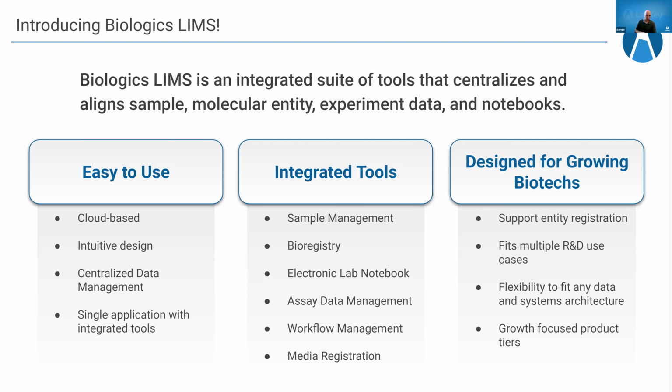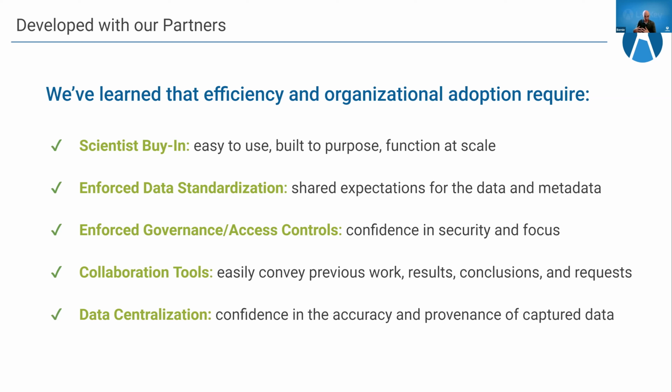This also helps prevent many of the painful effects of turnover, like you heard from Dylan yesterday at OSU. As people cycle through your organization, their knowledge and accomplishments can be maintained. You won't find some huge mass of files in one particular place that may or may not be full of critical information that you can no longer process. It's all in one place in an expected form, and it helps maintain that traceability and availability.